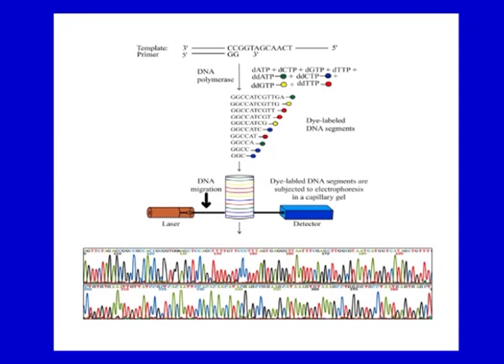So, on your screen if you can see here, when you take 4 fluorescent dyes, different colored dyes are attached to each dideoxy analogue, then you get fragments of different sizes as the PCR goes on, and these fragments run on the same gel, and the extensions are done in the same vessel.